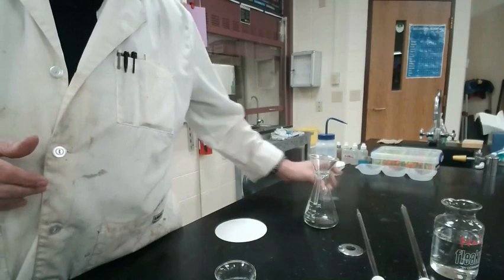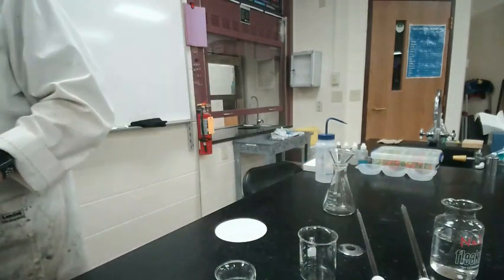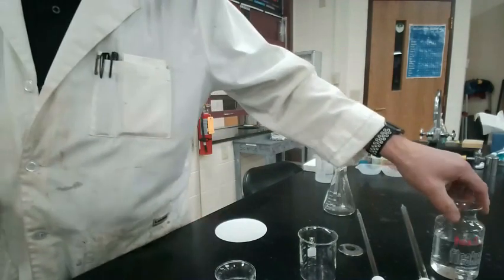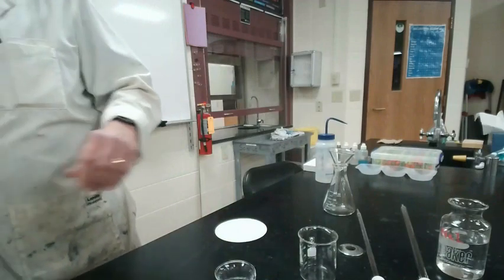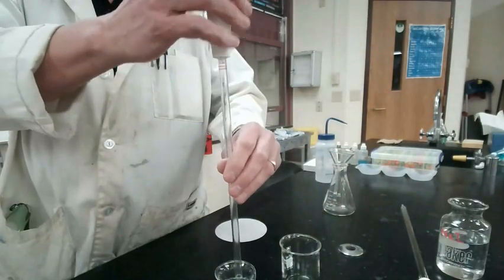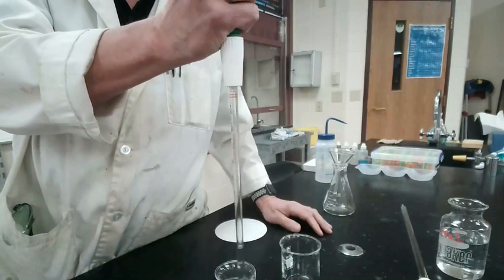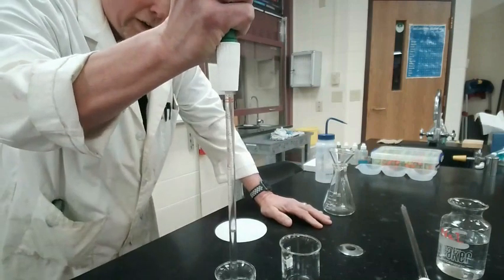Now, we're going to mix these together. For your lab, ladies and gentlemen, you're going to do 20 milliliters of sodium iodide with 10 milliliters of lead nitrate. Everybody did 10 milliliters of lead nitrate. I'm going to mix them together in this beaker. So I'm going to put my pipette in here. I'm going to pull up 10 milliliters of lead nitrate.